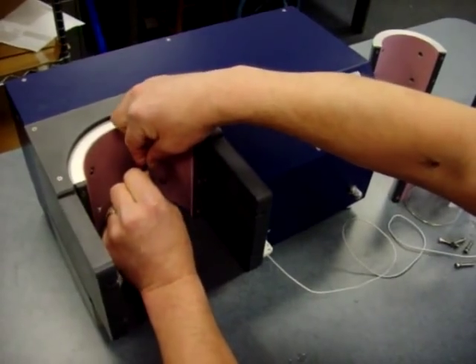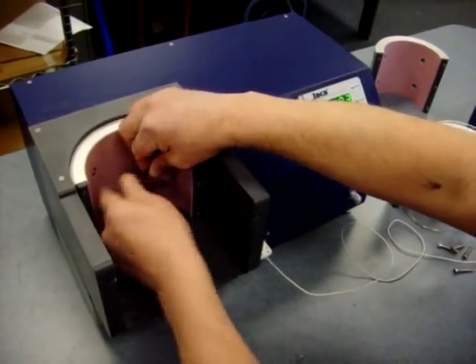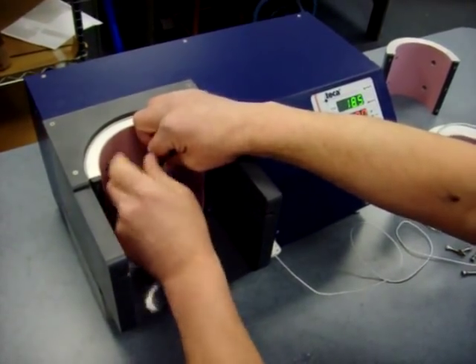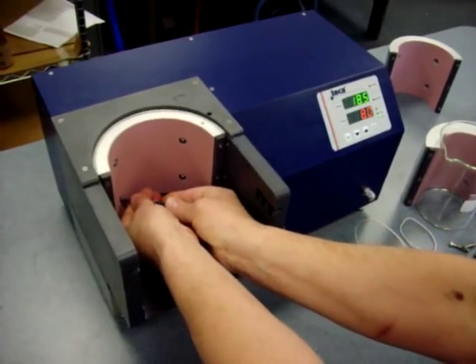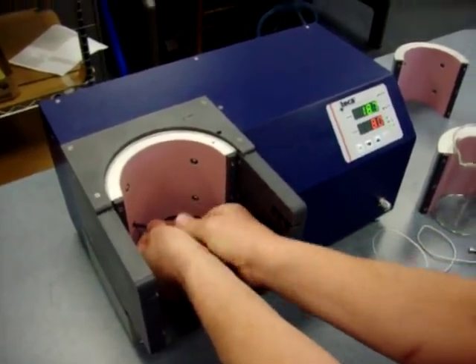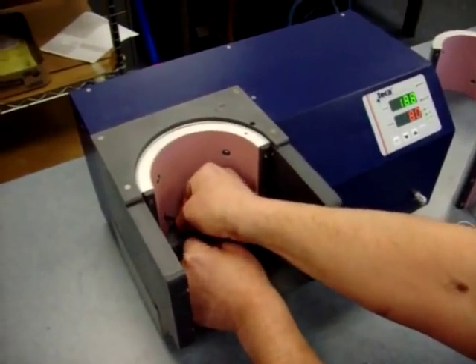Is the remote sensor included with the product? Yes, the remote sensor is included and I suggest using that. It's already auto-tuned for that, so it knows the system as far as how fast and how slow everything cools, and it's going to give you a lot better control if you're controlling right at the fluid temperature.